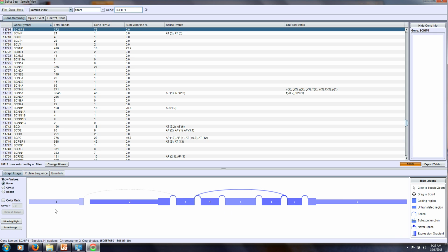see. The coloring or shading is done based on how many reads we saw for the sample. So the darker ones had more reads, and the lighter ones had less reads. If it's a dotted line, there were actually no reads in the sample that we're currently looking at. The exons are drawn to scale based on how large they are, and the portions that are drawn thin are non-coding. The thick parts are actually the coding region.